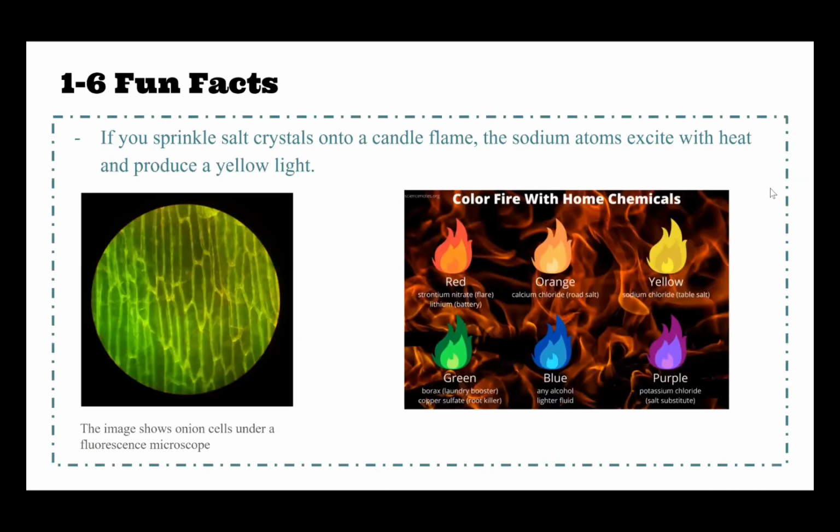To wrap things up, some fun facts about fluorescence: if you sprinkle salt crystals onto a candle flame, the sodium atoms excite with the heat and produce a bright yellow light. On the slide, you can also see an image of onion cells underneath a fluorescence microscope.